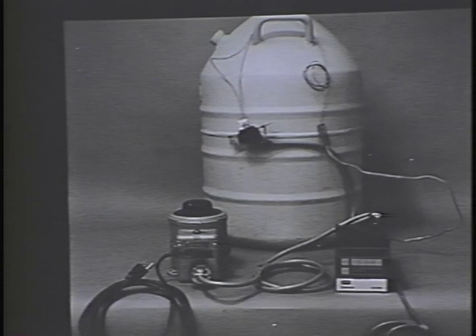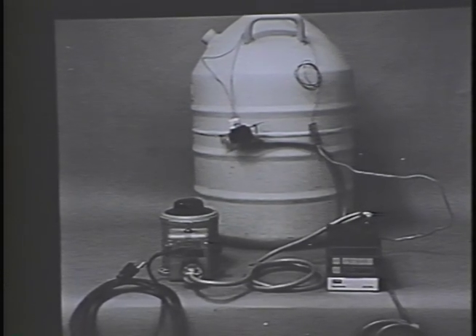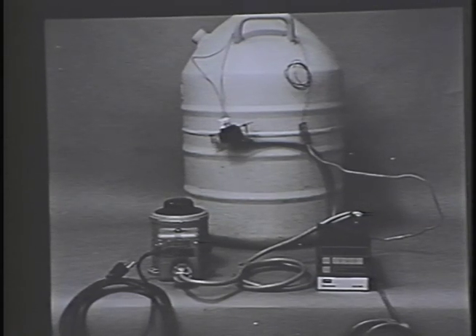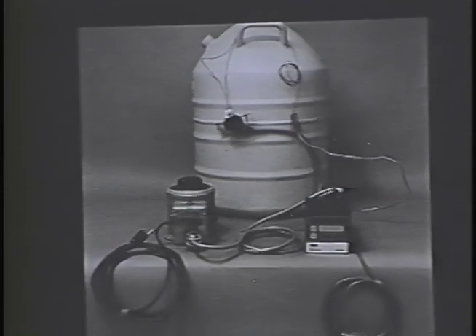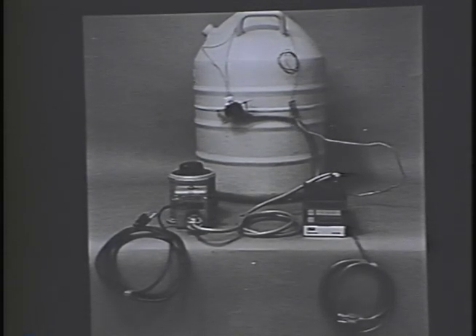I freeze substitute my samples in 1% osmium tetroxide and acetone for 3 days at minus 90 degrees, after which time the samples are gradually warmed to room temperature and either infiltrated with resin for routine section microscopy or dried from CO2 using the critical point method. Next slide.